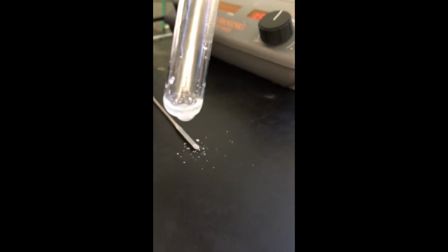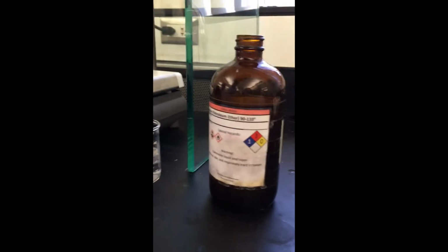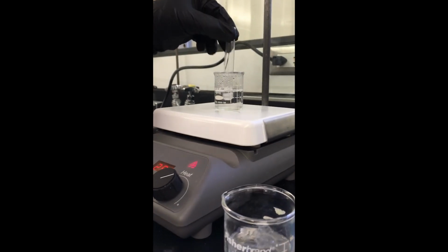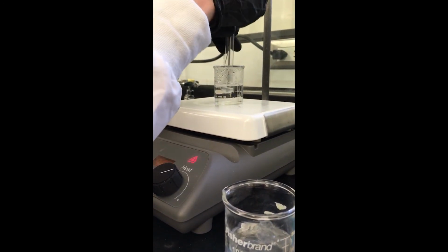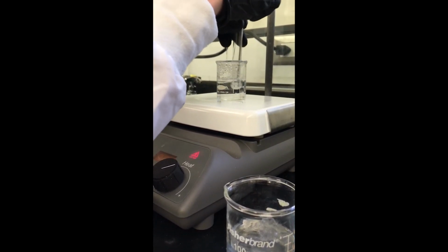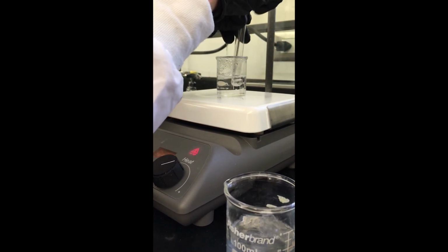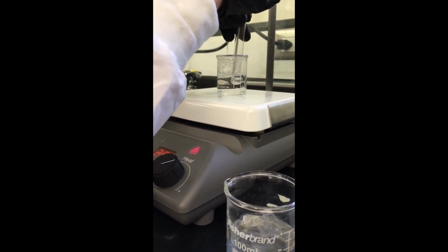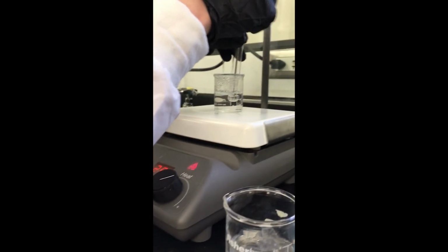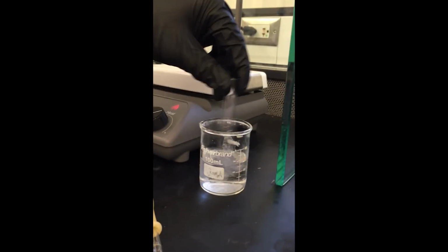So as you can see, there are still crystals that aren't dissolving, so I'm going to go ahead and add just a little bit more ligroin. Okay, so I'm going to continue. I've added some more ligroin, and I'm going to continue just heating this up and stirring it until things dissolve. So now that everything's pretty much dissolved, I'm going to go ahead and stick this in an ice bath.